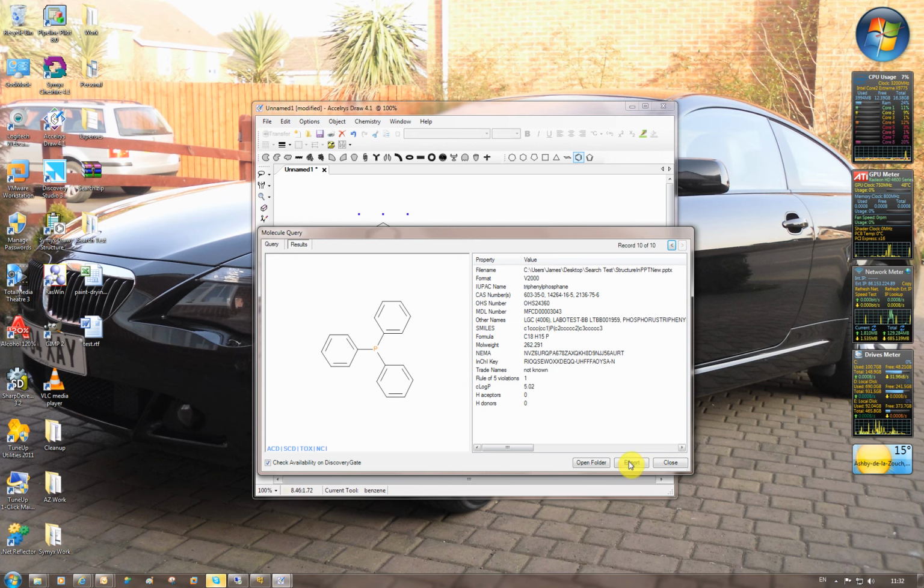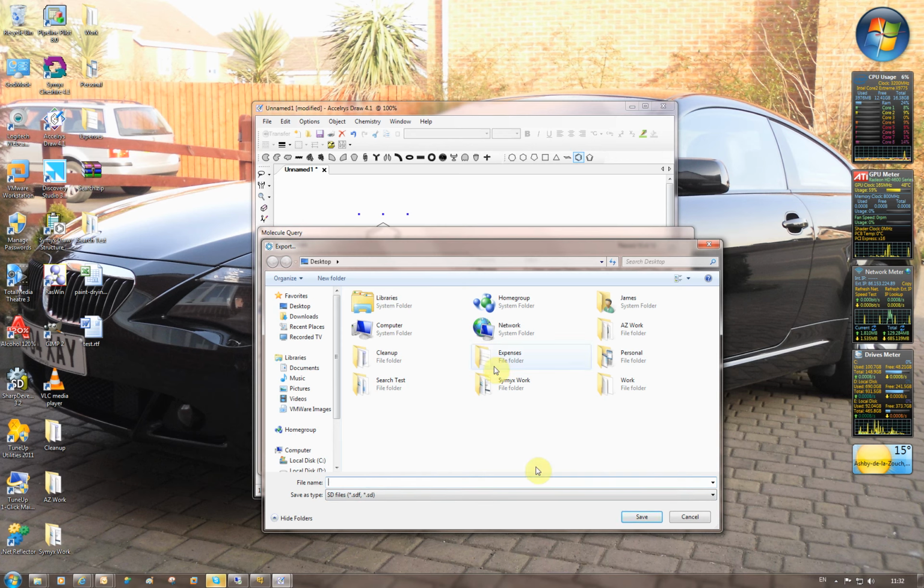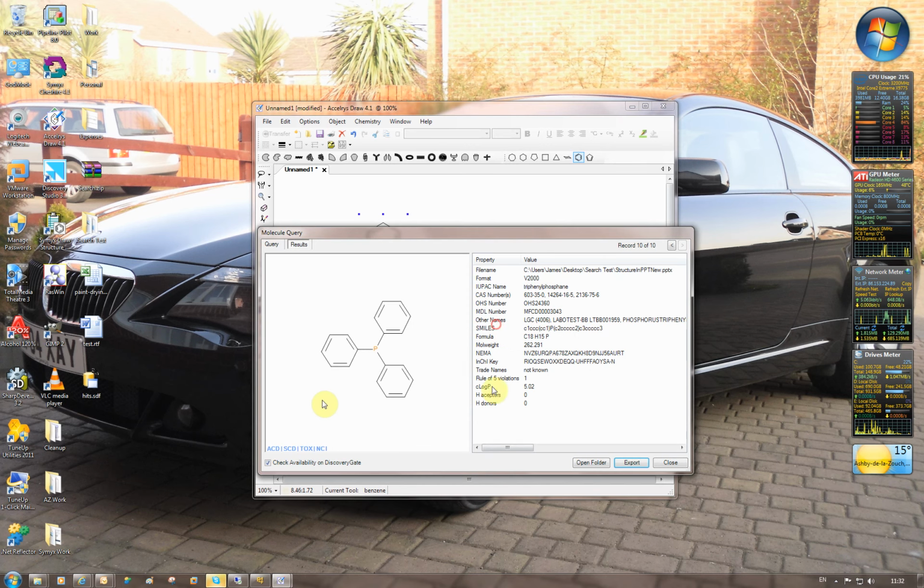Again, once you have, in this case, you can export the resulting hitset as an SD file. So we could call this hits. And a part of the content of the SD file is to include the file name. So you're building essentially an index of your folder with what structures were in which file. And that's essentially it.